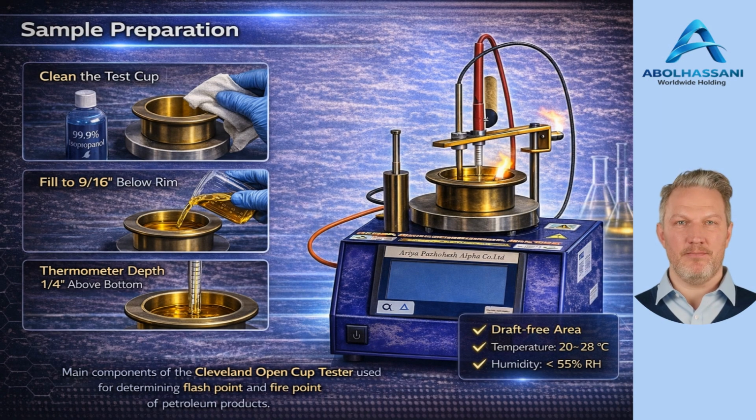Sample preparation. Sample preparation requirements are described in ASTM D92 Section 9, Preparation of Apparatus and Sample. The test cup must be clean, dry, and free from previous residues before the test begins. The sample should be filled to the specified filling mark in the cup to maintain correct vapor space above the liquid. Proper preparation is essential to prevent contamination and ensure reliable flash point measurements.